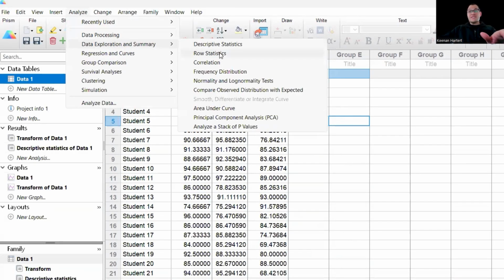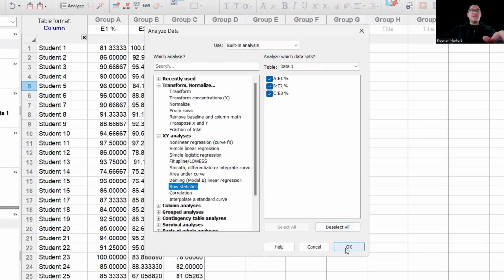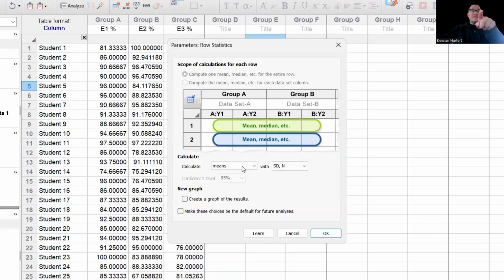So moving back into some good data analysis stuff, one of my favorite things is actually going to give me some row statistics. This is actually going to go row by row in this case, instead of like the columns like I showed you. Here's what I want with this. And this can change too with the customization. I can do a total if I wanted. I can do mean, median.